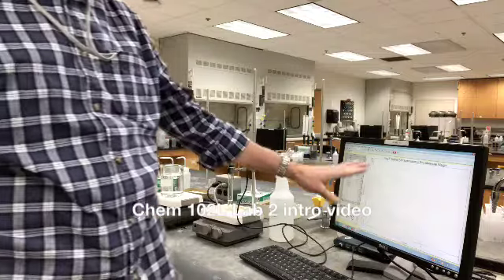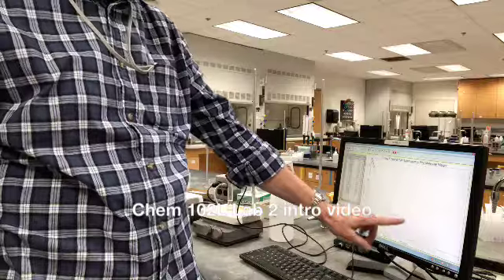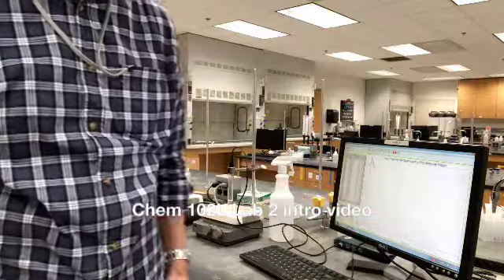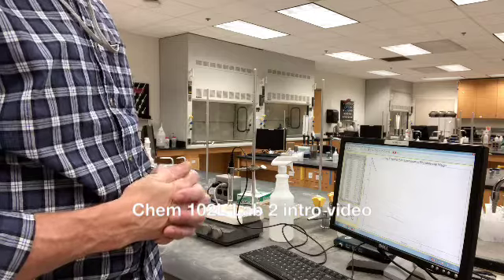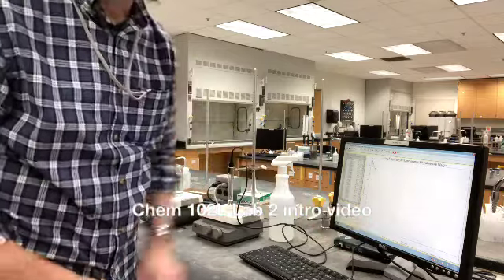I have this set up so it shows you a couple curves in here. One is for the pure lauric acid, and one is for this mixture, and I haven't identified which mixture that is for you, so it doesn't provide any clues about what you might get. Your unknown might turn out to be a different one from this one here.